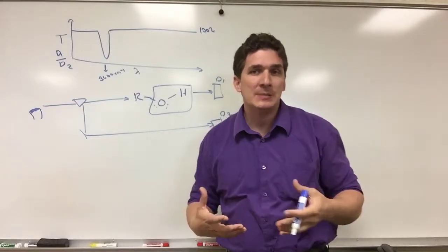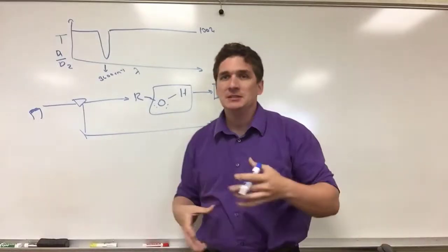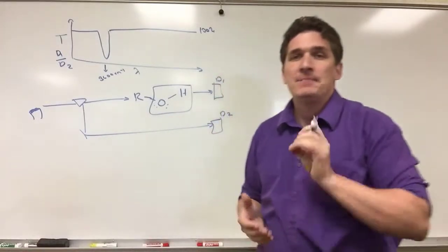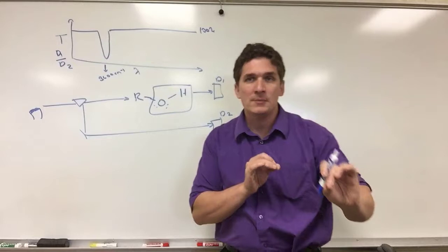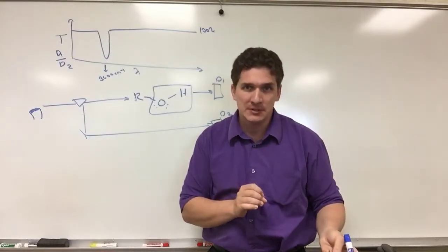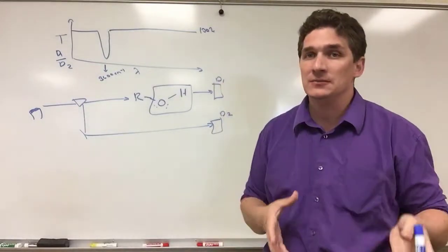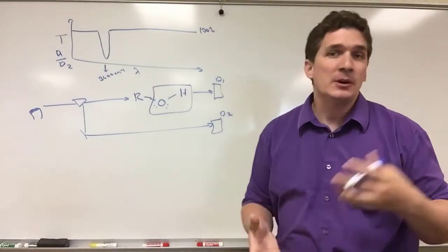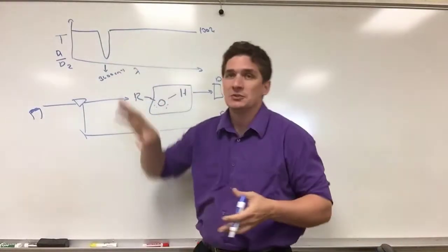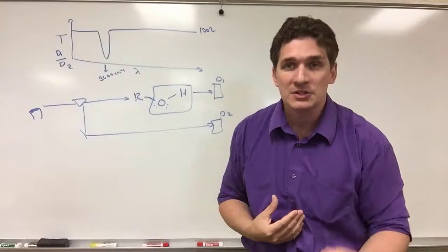Now, this is a very glorified, simplified molecule. Typically, when we do this with a sample, we measure a whole bunch of things, so we're going to see something corresponding to each functional group. That said, IR can be reported both in terms of transmission as well as absorbance, and you'll see it reported both ways. The thing is, you're looking for a peak. My understanding or experience is organic chemists like to work in transmission, which makes sense. They were the first ones to really implement this technique on a large scale.